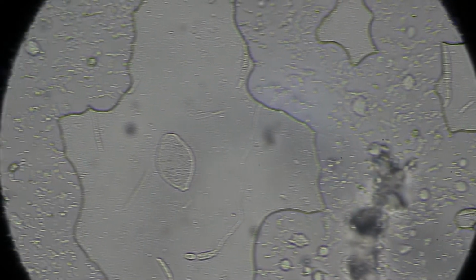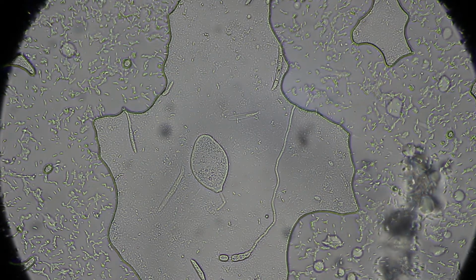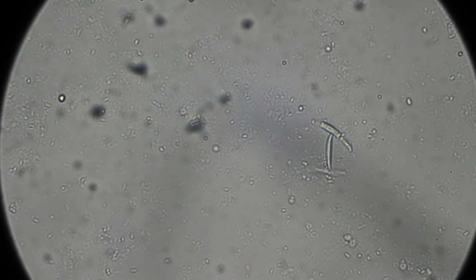But there is still hope. The surface tension also creates small water drops under the slide, and those reservoirs become the sanctuary of the survivors, where life can still thrive.